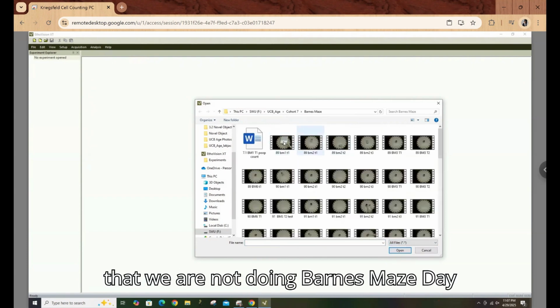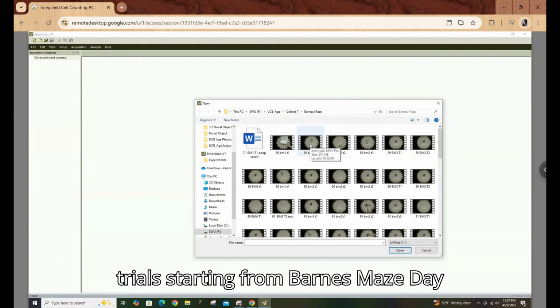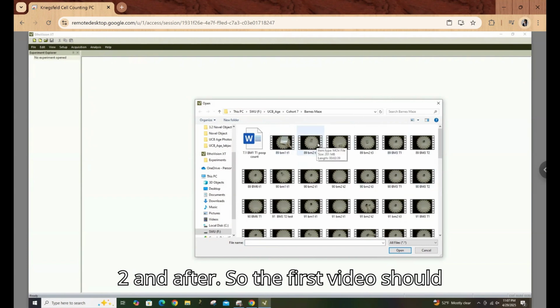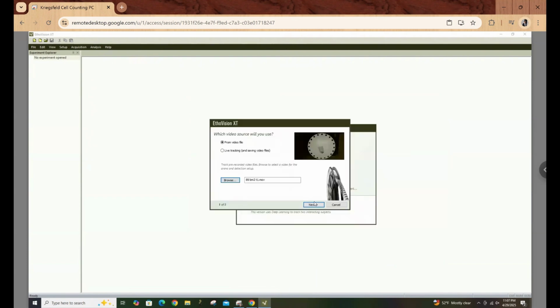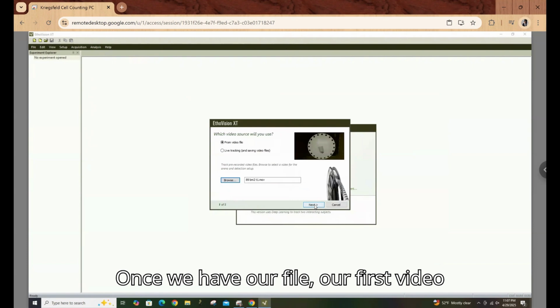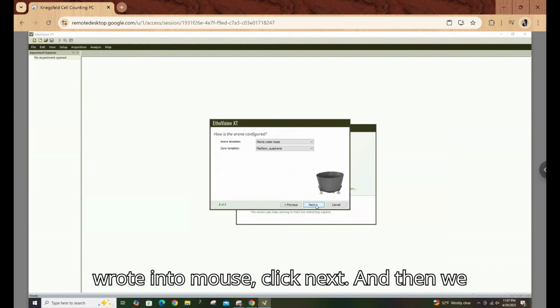And also remember that we are not doing Barnes Maze day 1. We are only analyzing trials starting from Barnes Maze day 2 and after. So the first video should be BM2T1. Okay, once we have our first video file, we'll click Next. Make sure it's rodent and mouse, click Next.